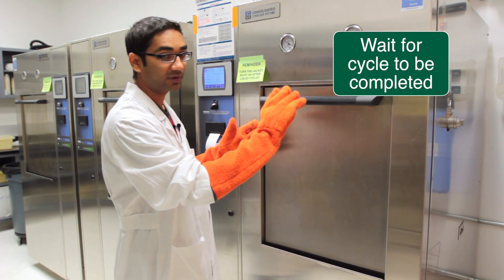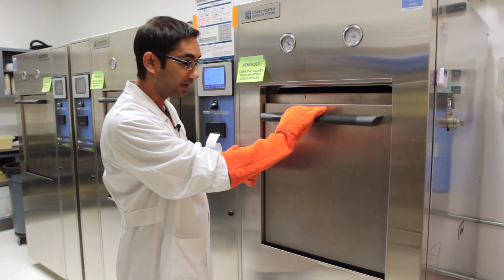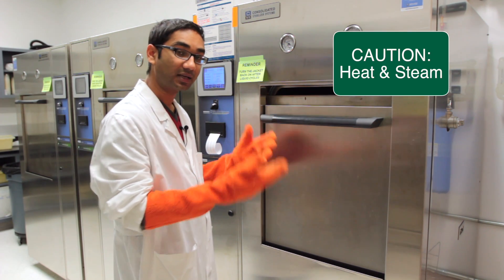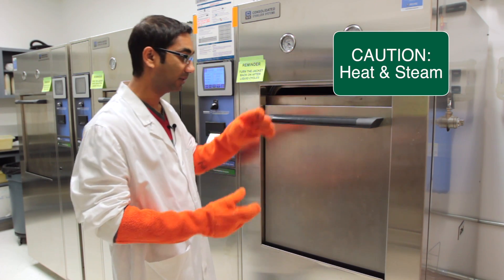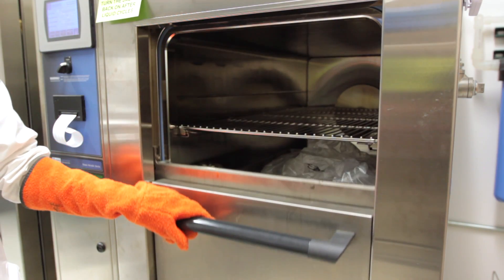How do you know when it's safe? Wait a couple of minutes once the cycle has been done, then pull the lever down slowly. If no steam is coming out, it is safe to open the autoclave. In this case no steam is coming out, so I can pull down the lever and open the autoclave.